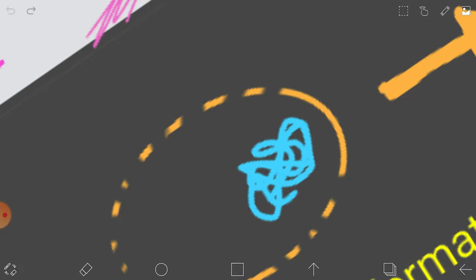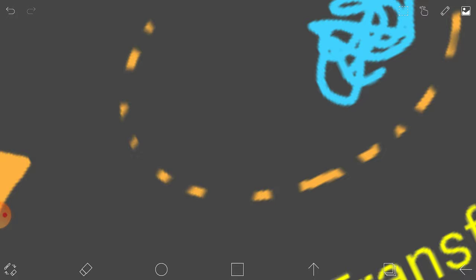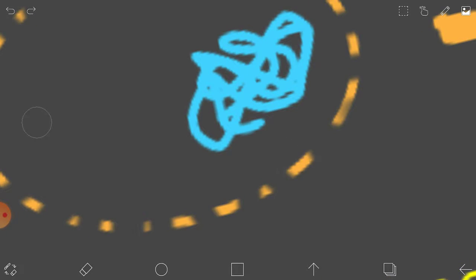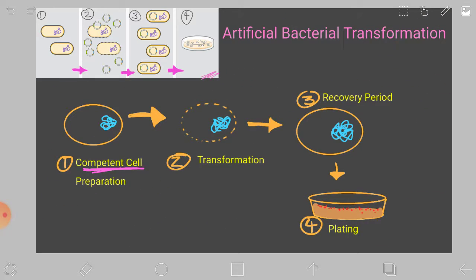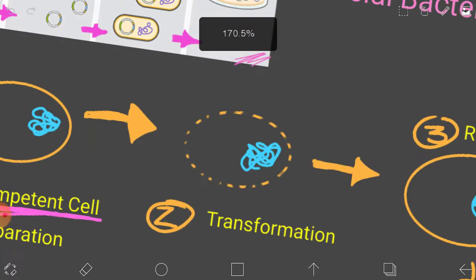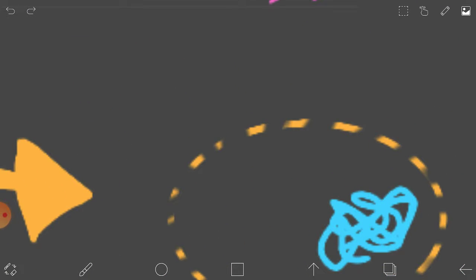Again, electroporation and heat shock are used in this process. Believe me when I say that this is the last step where those two methods will be used. Transformation is more focused on, believe it or not, just having the plasmids get inside there.